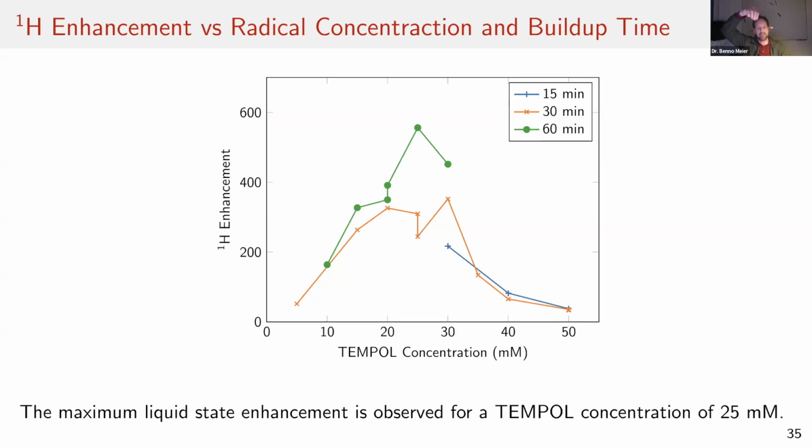That was the idea. But what happens is the bullet sometimes attaches to the wall, and then it doesn't move, and you reduce the pressure of the stream further and further, and then at some point the bullet comes loose and drops. Actually, at some point, Karel showed me a little experiment. He took a bullet, filled it with liquid, and dropped it from a height of 1 centimeter. This drop was enough to cause a spillage.